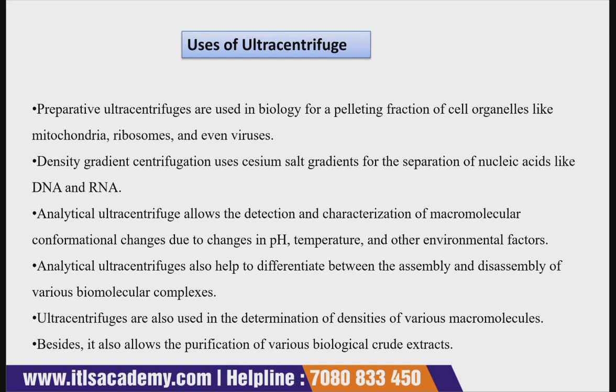Analytical ultracentrifuge also helps to differentiate between the assembly and disassembly of various biomolecular complexes. Ultracentrifuges are also used in the determination of densities of various macromolecules. Besides, it allows the purification of various biological crude extracts. So these are certain uses of ultracentrifugation.